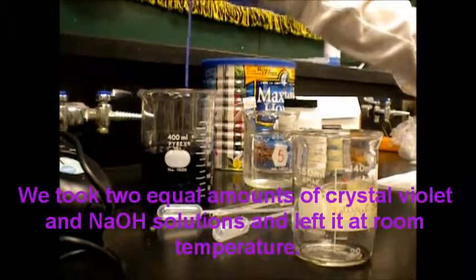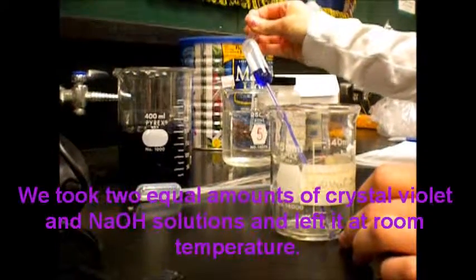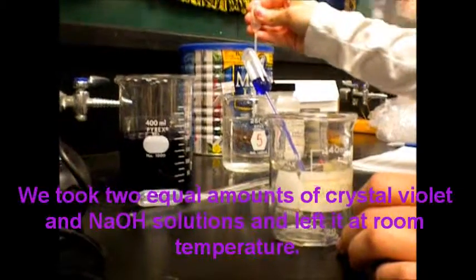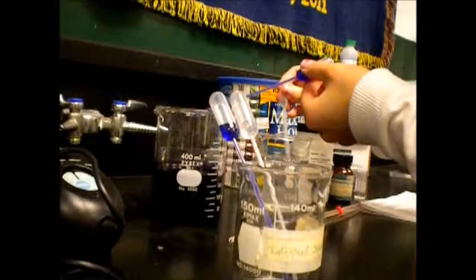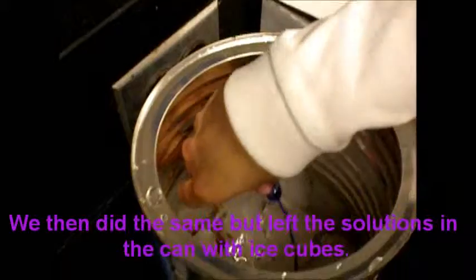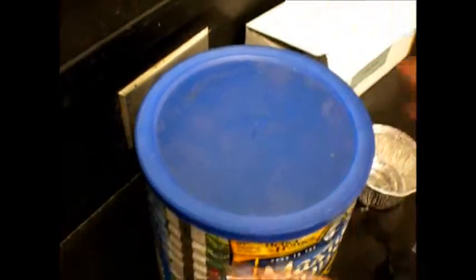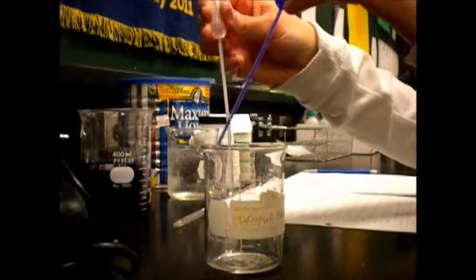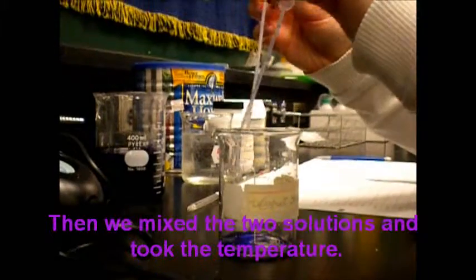We took 2 equal amounts of crystal violet and NaOH solutions and left them at room temperature. We then did the same, but we left the 2 solutions in the can with ice cubes. Then we mixed the 2 solutions and took the temperature.